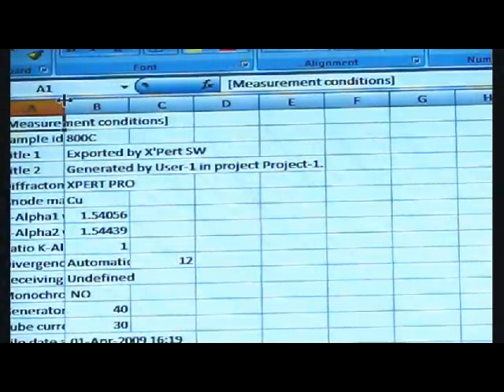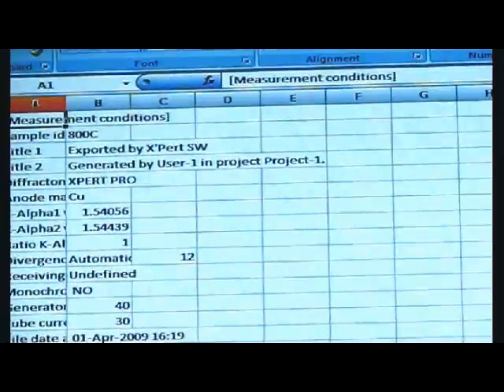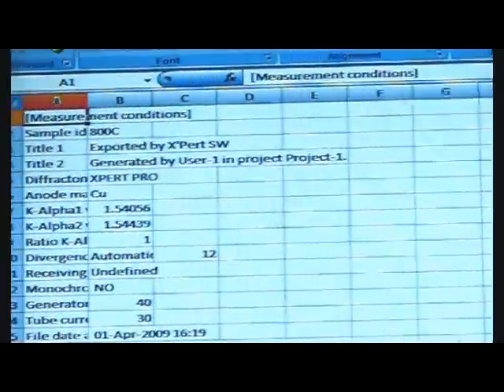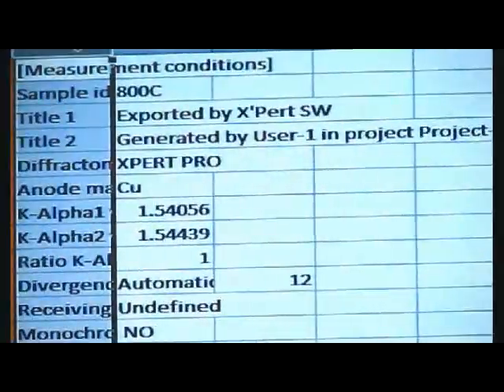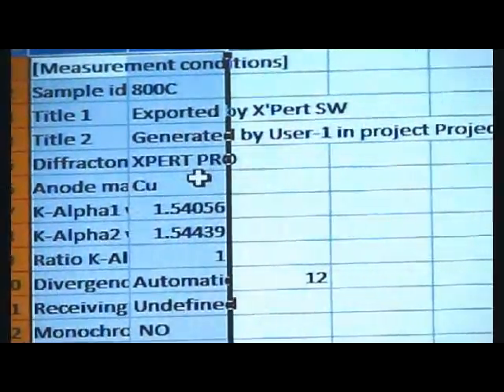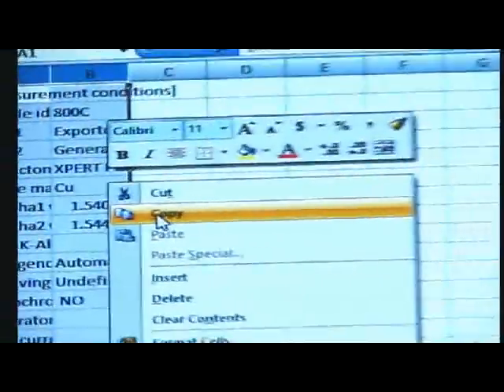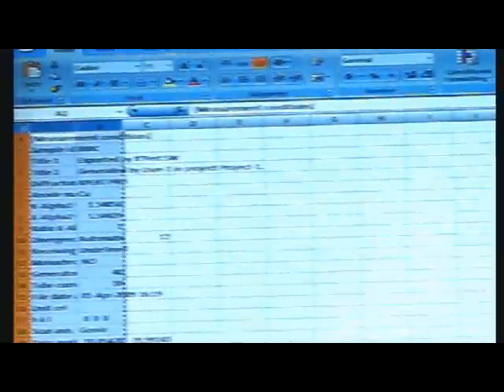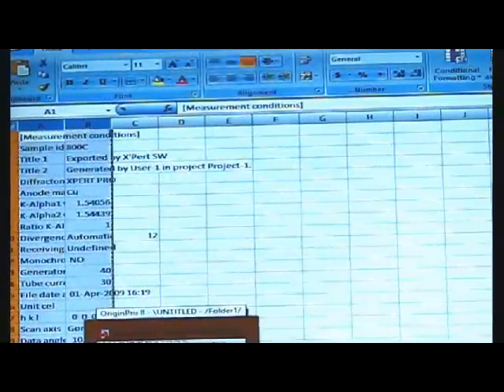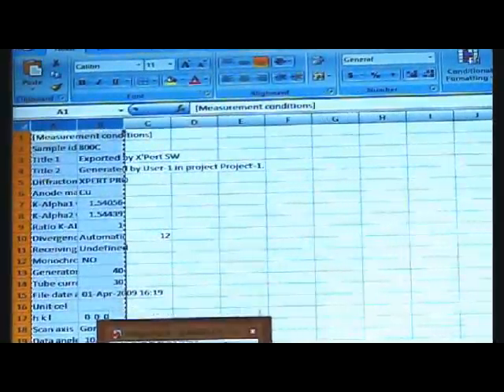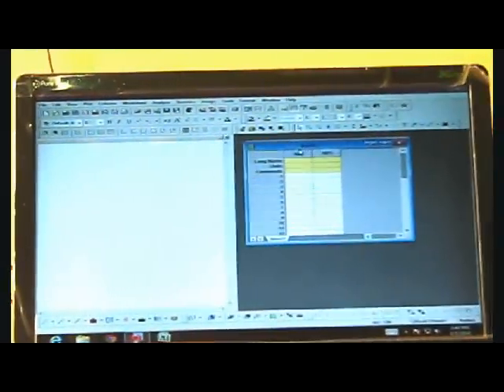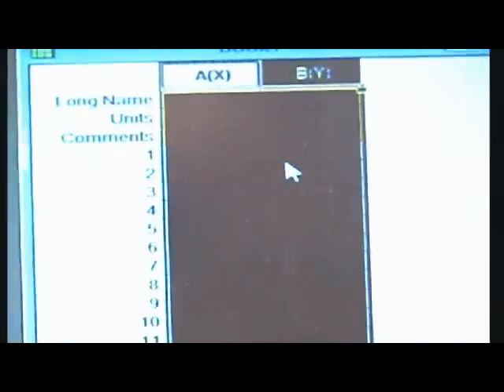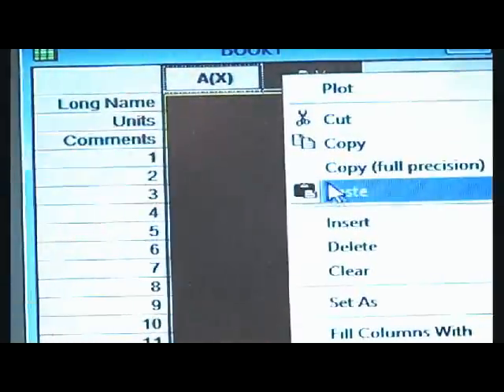First we have to plot the given XRD data on the Origin PRO 8 version. Select the Excel data and right click copy. Now we have to copy it on the Origin PRO graph book. Take the Origin PRO graph book, select the A(X) and B(Y) columns.